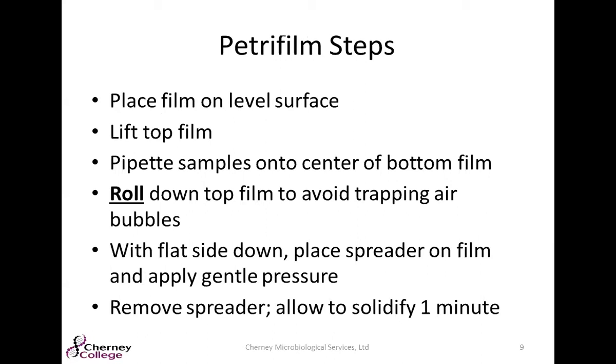Don't just let that film go, because that's going to trap air bubbles in your film, which is only going to cause you headache down the road during interpretation. Some of these Petrifilms, you have to see which colonies have gassing. And so if you have air bubbles trapped in there from setup, it's only going to cause you a headache. So do yourself a favor during setup and make sure that you're rolling the top film down just to avoid trapping those air bubbles in the first place.